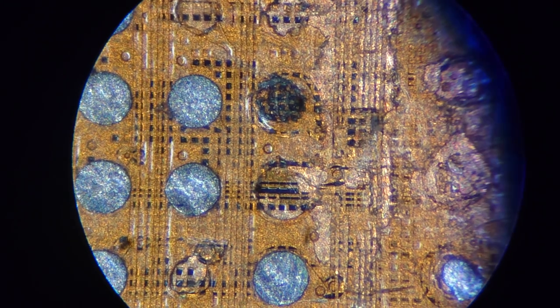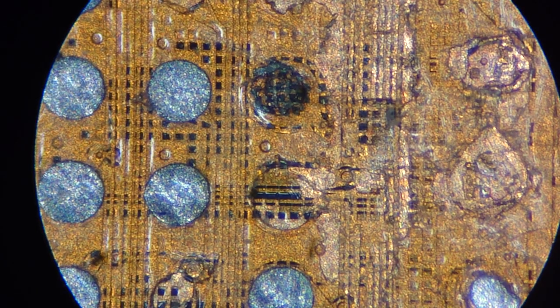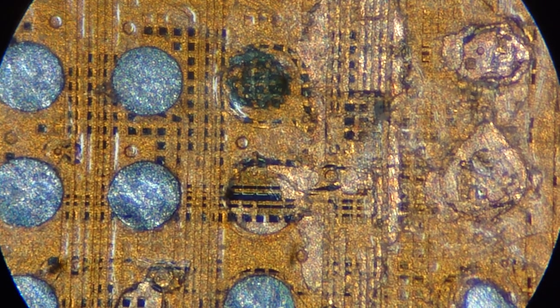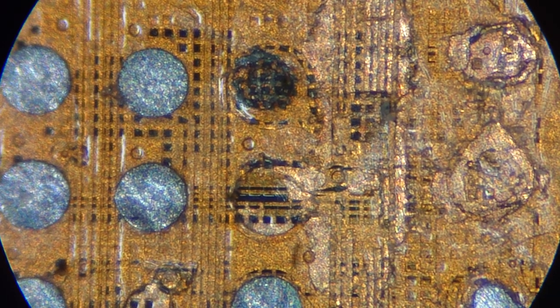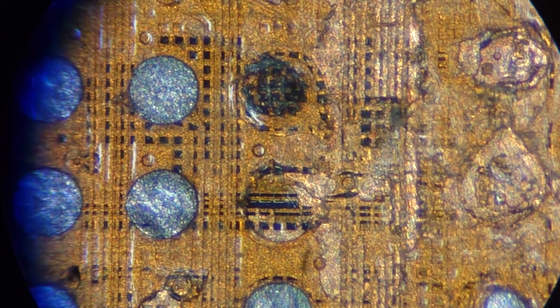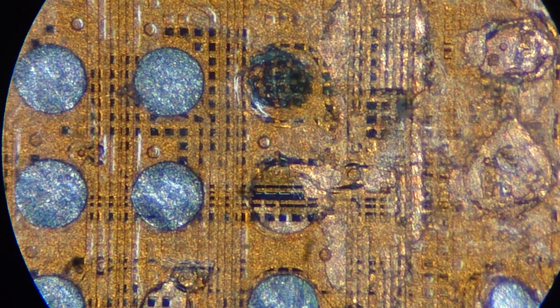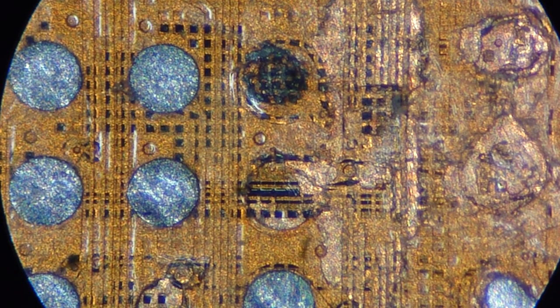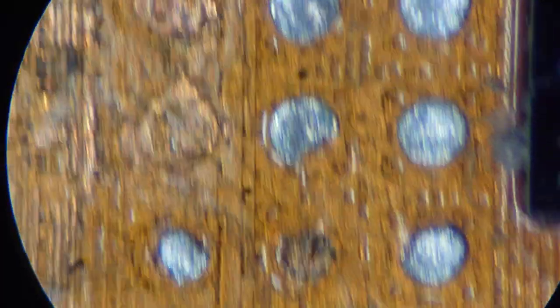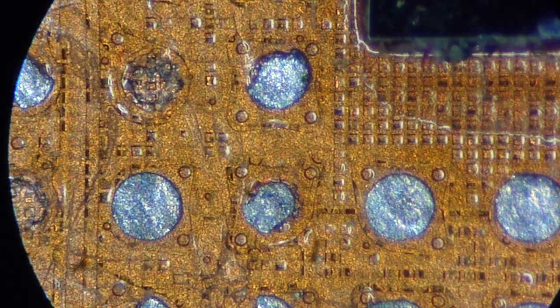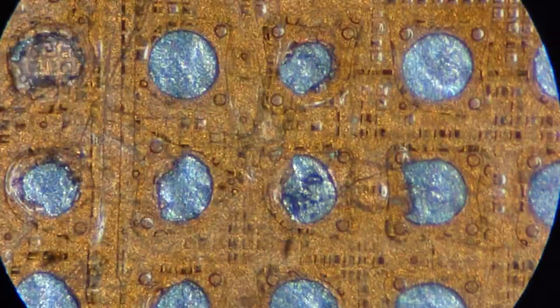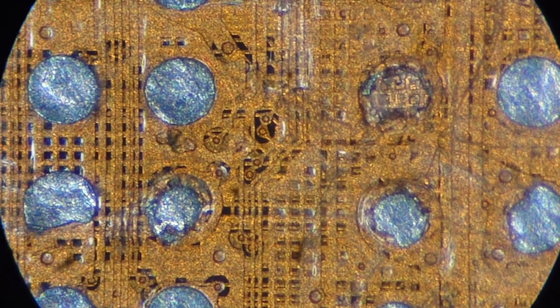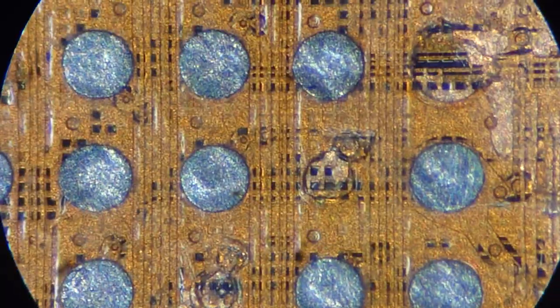If you look at it attentively you might have noticed that again, left and right parts of the frame have a fuzzy image while the center is pretty sharp. Here's a part of our processor. I should move a bit around it. As for me, we have very nice picture, pretty sharp. I don't know why you should replace this microscope with any other one.